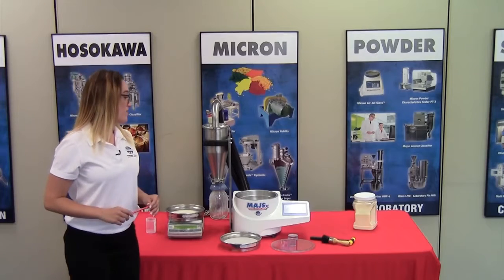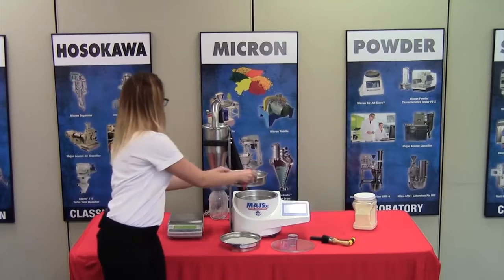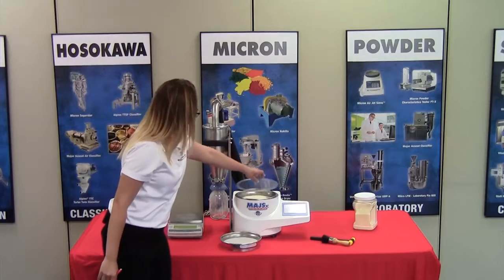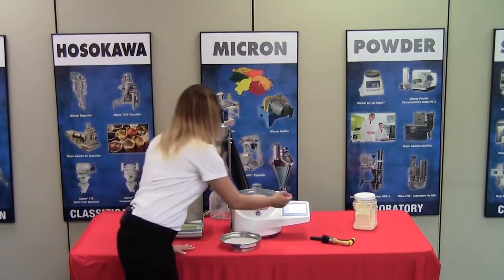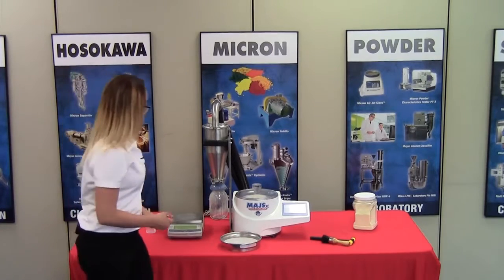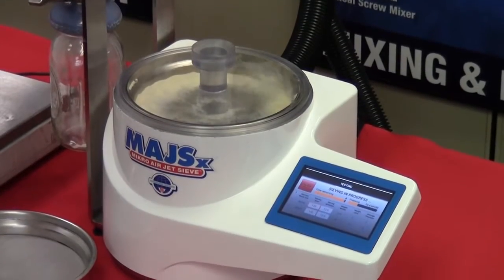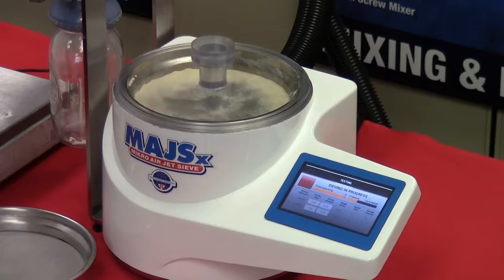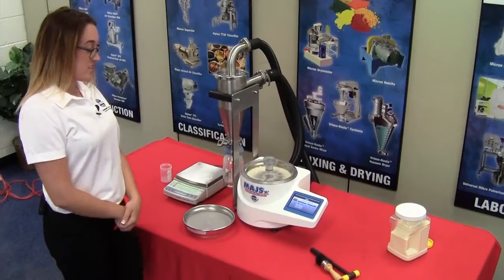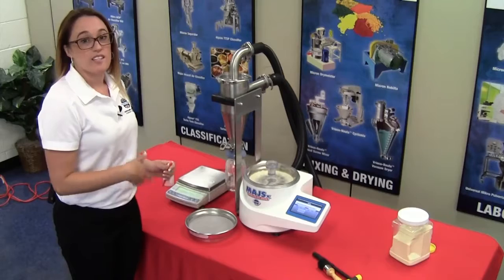From here it says place the 45 micron sieve screen with the sample on the sieve. We're going to put the lid on top of it, and then we're going to press next. After that, it's ready to sieve, and you're going to press start. Once the sieving is completed, you're going to press next. Then the software will indicate the next step for you.